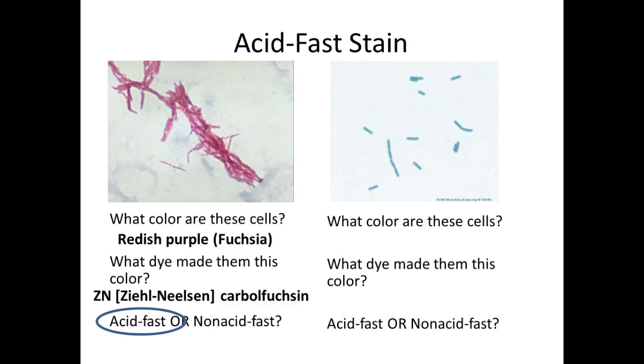So a common abbreviation that you'll see is AFB, which stands for acid-fast bacillus. Not bacteria, bacillus. Although they are bacteria, and in fact of a genus of bacteria called mycobacteria, that we'll talk about in the lecture for today. So other cells will stain whatever dye you're using as a contrast, as a counterstain.